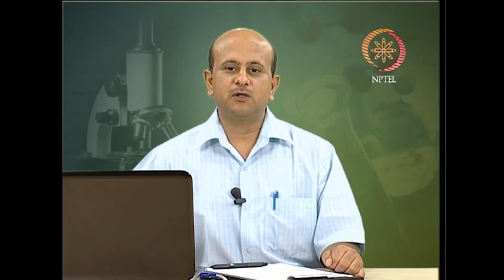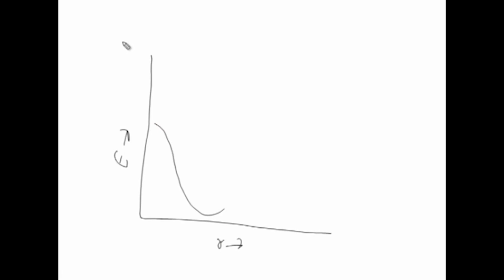Let me show you here, in a very simple way, the principle of fluorescence spectroscopy. If you could recall the energy diagrams which we have made in these forms.